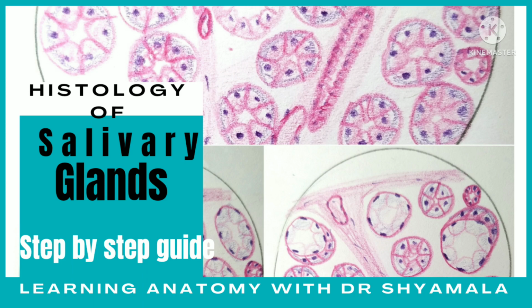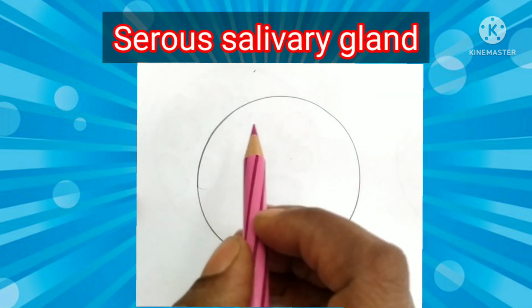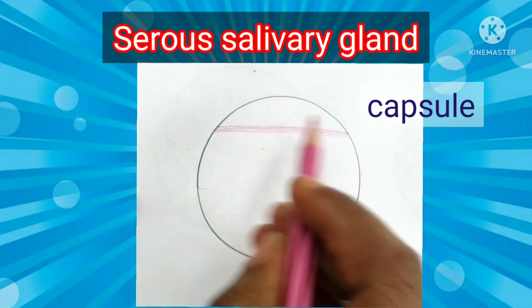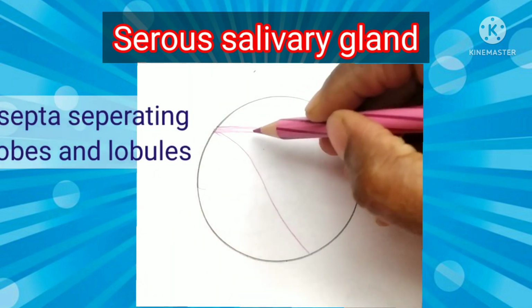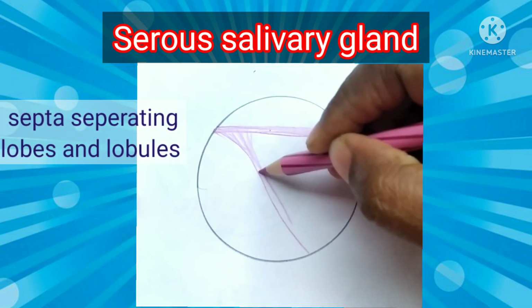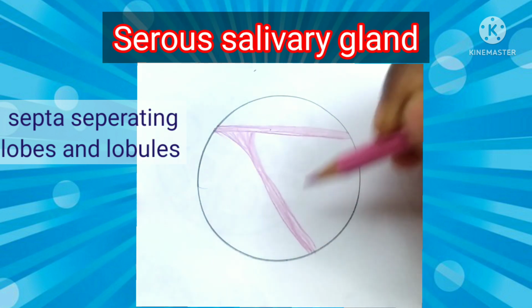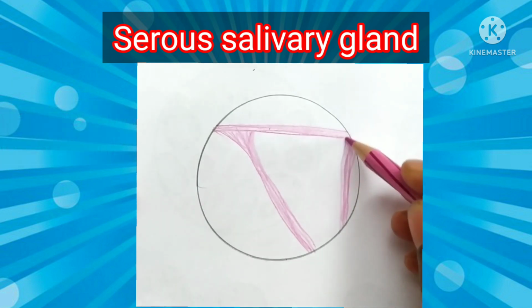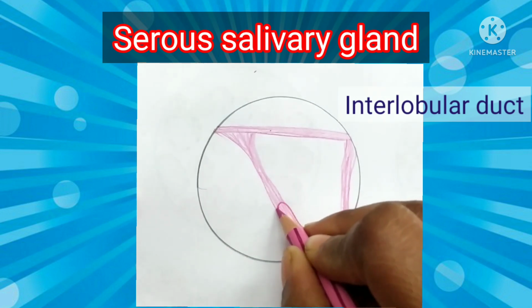Today we are going to discuss the salivary glands. First, the serous salivary gland, which is seen in the parotid gland. As these are the major salivary glands, they are covered by a capsule, which is nothing but dense connective tissue. The connective tissue sends septa, the fibers below, and divides the salivary gland into compartments. The bigger ones are called lobes and the smaller ones are called lobules. So the septa separate the complete gland into lobes and lobules.